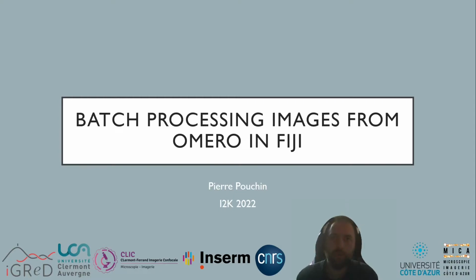Hello everyone, I'm Pierre Pouchin from Clermont, where I work as a research engineer at the Institute of Genetics Reproduction and Development. Here we have a confocal imaging facility called CLIC, where we do a lot of images, and thus we developed, in collaboration with MICA, Microscopie Imagerie Côte d'Azur, two ImageJ plugins to easily interact with images on OMERO.